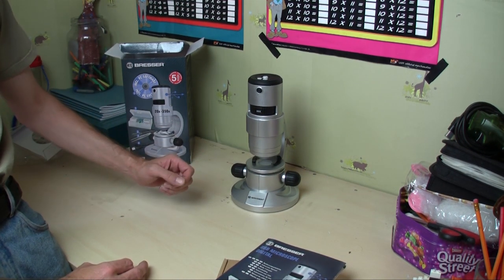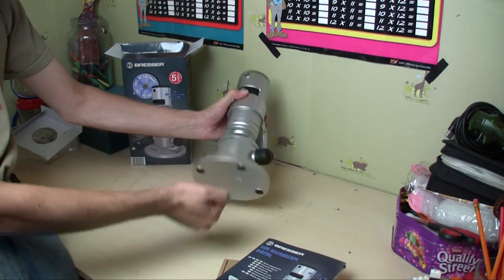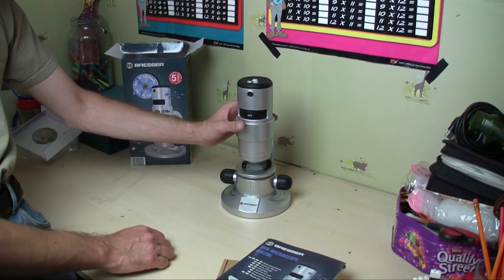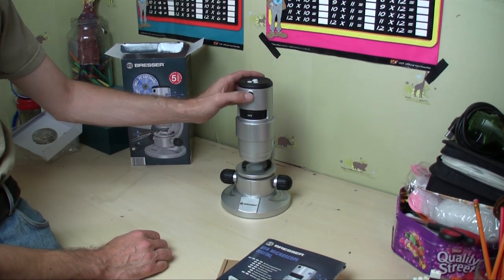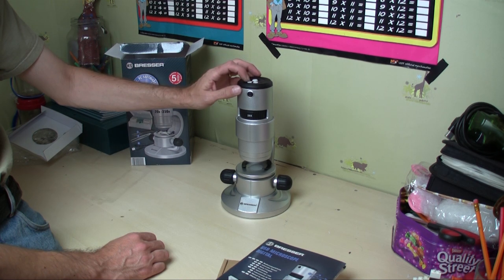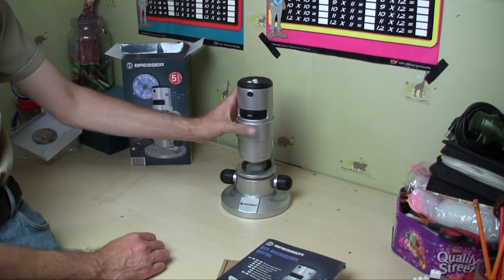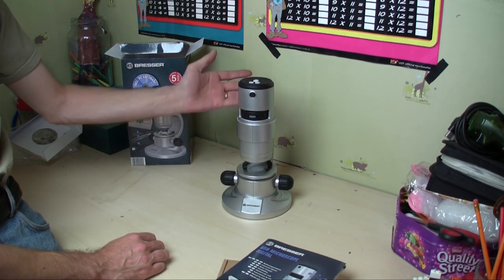Take this out of its bag. At first look it looks pretty impressive. Yes, this is plastic, but you wouldn't expect metal for around £30. You've got a camera button here so you can take pictures, an on-off button, controls going darker and brighter for your lamp. Here you've got times 20, times 80, and times 350 magnification.